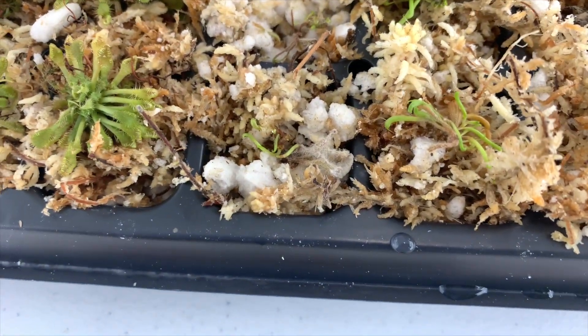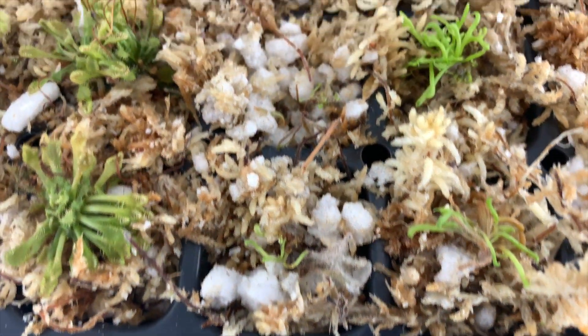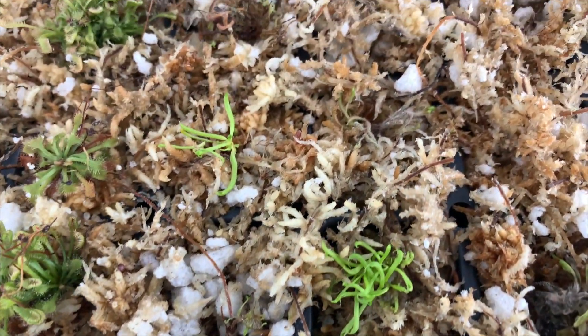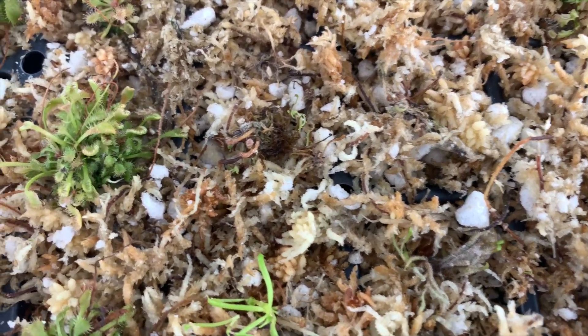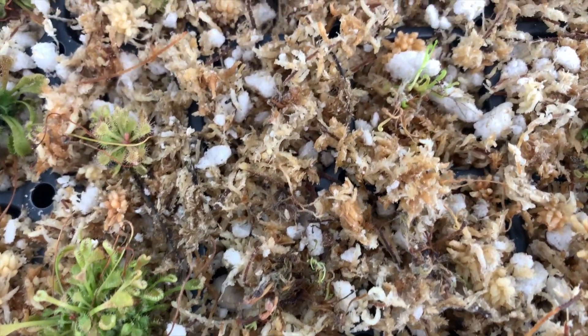The Darlingtonia — some of them are still okay, but some of them actually fully died. Like those over here, they actually have some fungus, so I need to spray them with probably some neem oil.